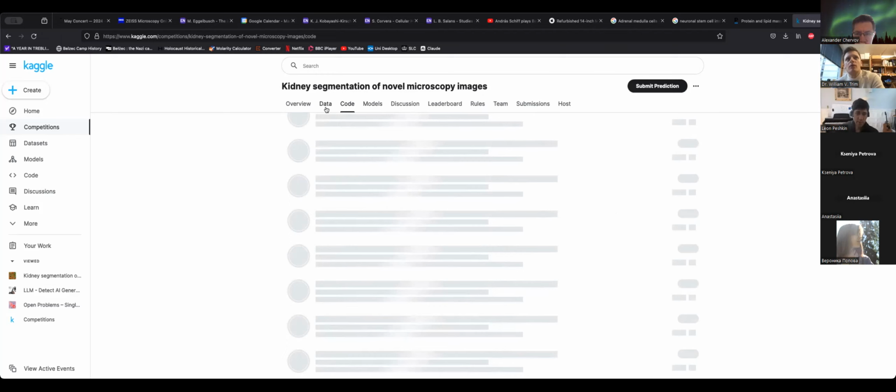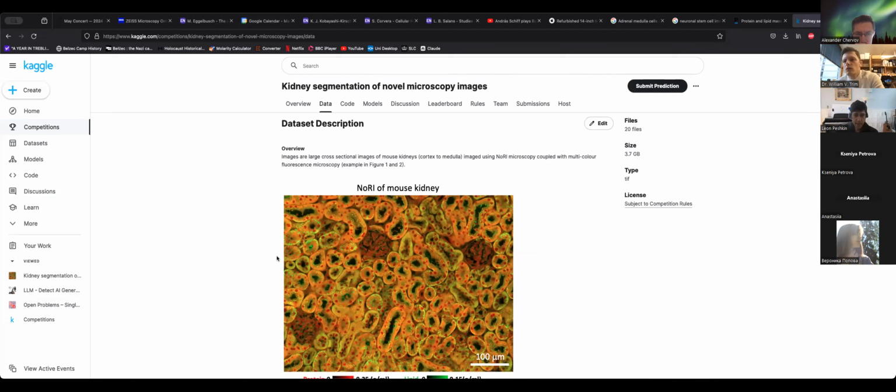Sorry, Will. Maybe I can offer some remarks as well here. Let's think about aging or disease, right? That's what we're trying to study using this tool. What kind of changes do we expect to observe between young and old kidney? We're measuring, let's focus on lipid and protein, right? Again, if it wasn't obvious, we're not measuring specific lipid or protein, but distribution of lipid and protein.